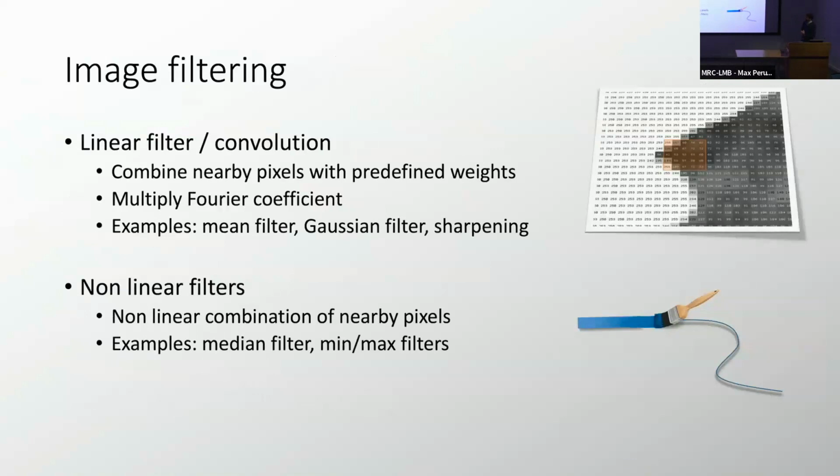So the basic thing we can do with an image is apply a filter, which is basically combining the intensity values in a neighborhood. We use this device, this little square, which represents this neighborhood, or what you can also call a filter or kernel.